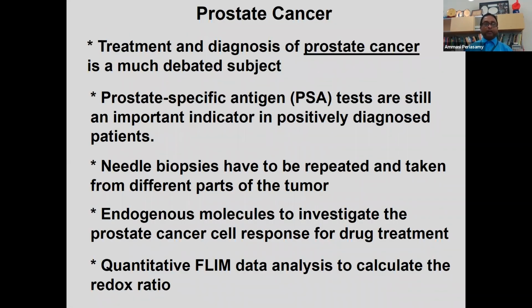Treatment and diagnosis of prostate cancer is a much debated subject. If you walk into the doctor's office, immediately they will ask you, do you want to have a PSA test, that is prostate specific antigen. It is still an important indicator, but the PSA test will show up only if you are a positively diagnosed patient. We are trying to see whether we can do early detection of prostate cancer using this metabolism or endogenous molecule, monitoring the signal using the lifetime microscopy method.